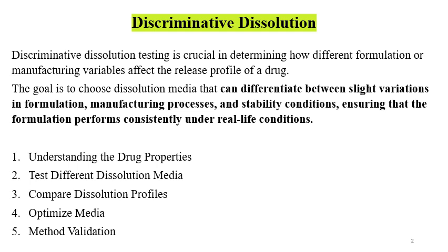And the main objective of discriminatory dissolution method is that we can differentiate between the good formulations and the bad formulations, or the good batches and the bad batches. QC release media or QC release dissolution method is required to be discriminatory so that the batches which may not be bioequivalent can be restricted from going to the market.